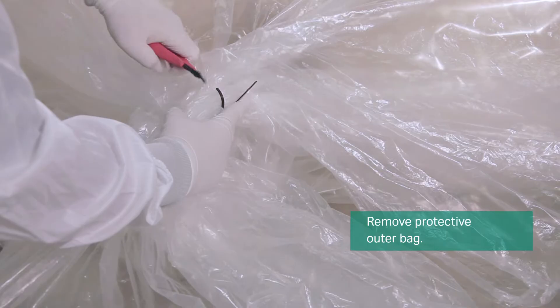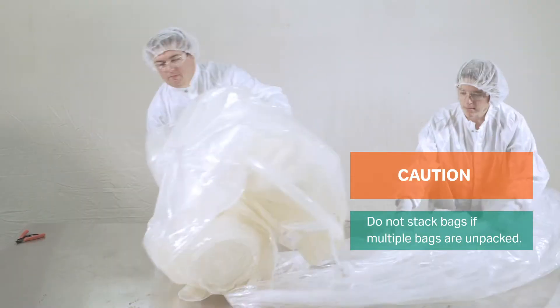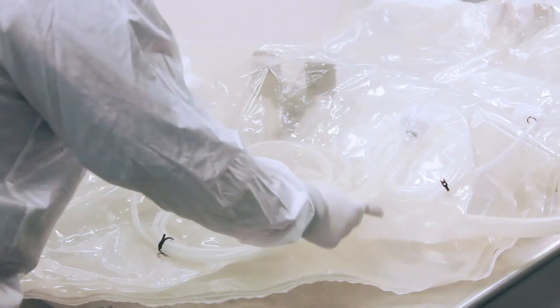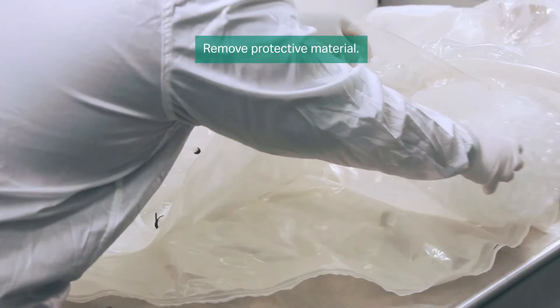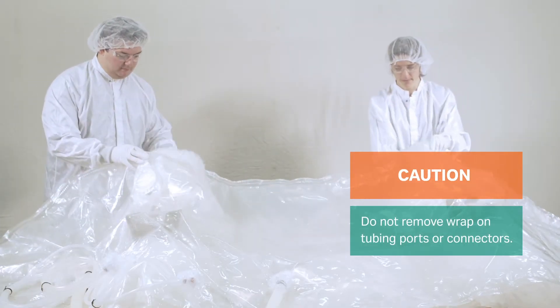Carefully remove the outer protective bag. Carefully unfold the bag assembly and remove bubble wrap and protective materials. Do not remove the wrap from the tubing ports, connectors and filters at this point.